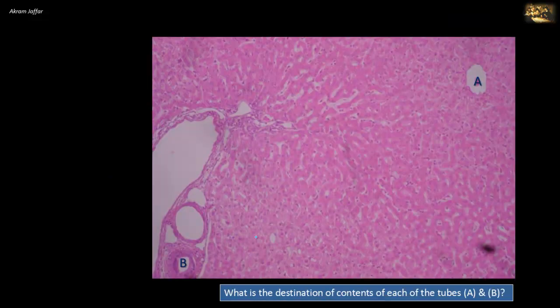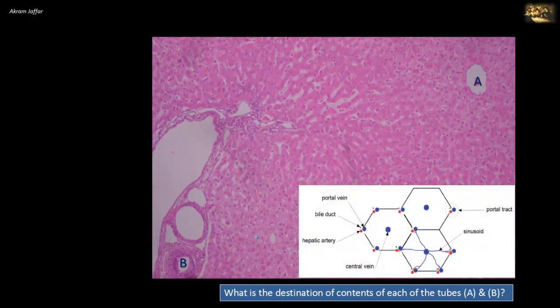What is the destination of contents of each of the tubes A and B? This section shows part of the classical structural unit of the liver, the hepatic lobule. You can see cords of hepatic cells radially arranged around a central vein. So A represents a central vein, or centrilobular venule.